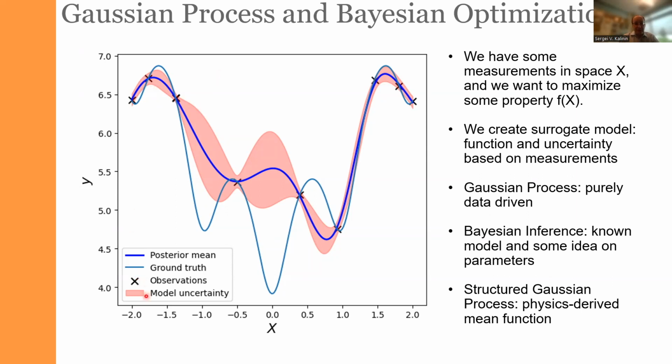From the very beginning, we discussed the situation when we have a one-dimensional parameter space. This is just a scalar and a one-dimensional function, so it is very easy to represent as a graph. At the same time, it represents a certain number of experimental situations. For example, this can be a concentration in a binary mixture, or a setting for one parameter on the aberration corrector. And the function represents the quality of the experiment.